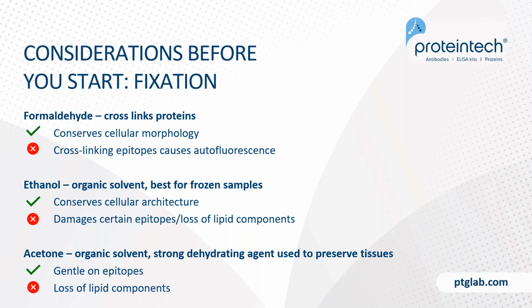Formaldehyde is good because it conserves cellular morphology, but it can cause some cross-linking of epitopes which can mask certain epitopes and can also cause autofluorescence, which I will go over later on.